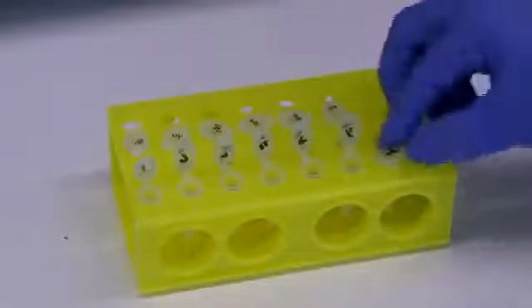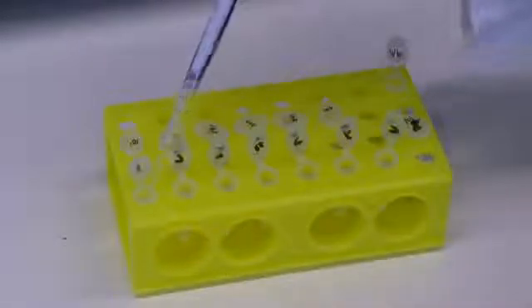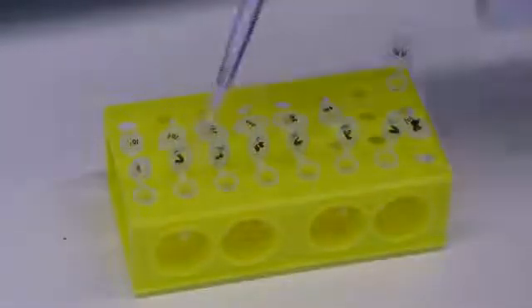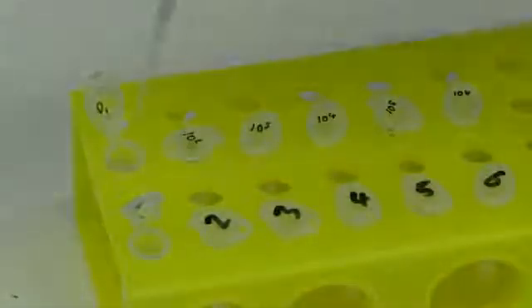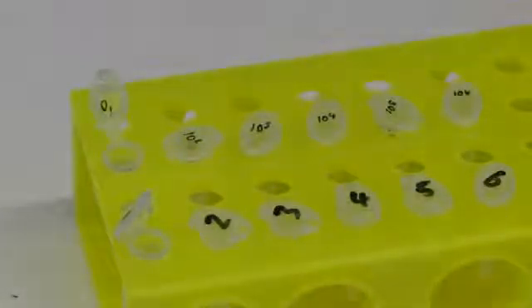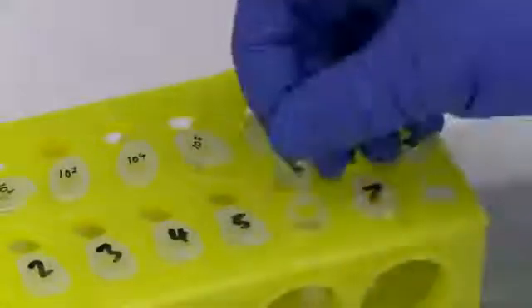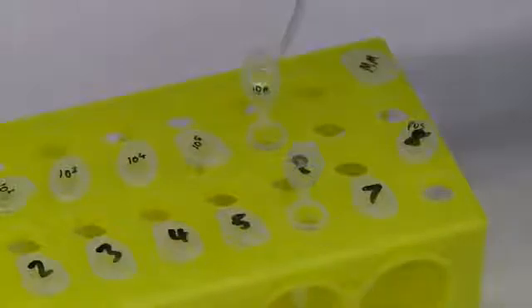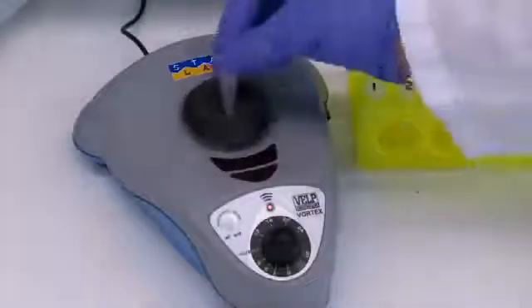Label your 1.5 milliliter tubes for each of your reactions. Now add your MasterMix into these tubes. Add the relevant template to your different reactions, closing the lids on the 1.5 milliliter tubes as you go along. Vortex and centrifuge.